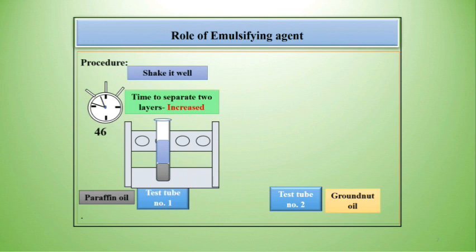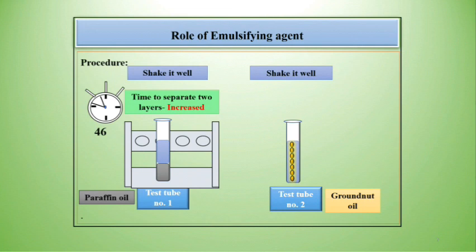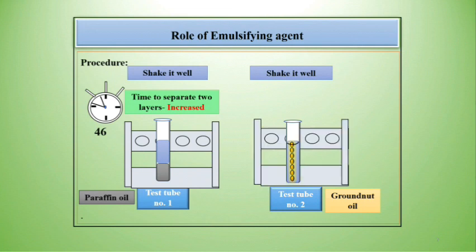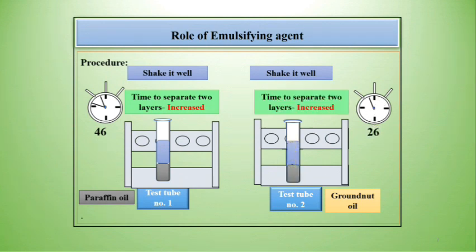Here, the time is increased. Similarly, shake well test tube number 2. Take the stopwatch, start it, and record the time required for complete separation of oil and water into 2 layers. Here again, the time is increased.